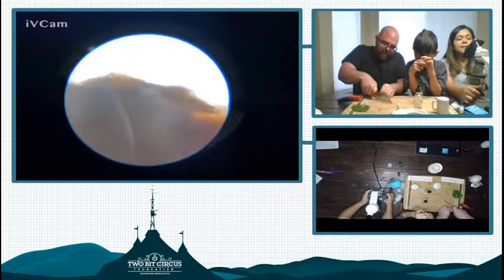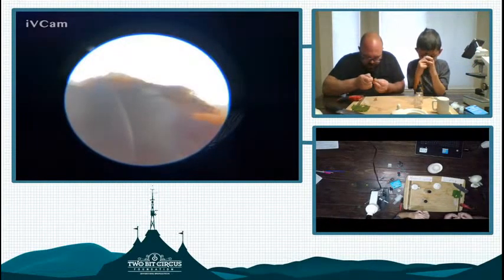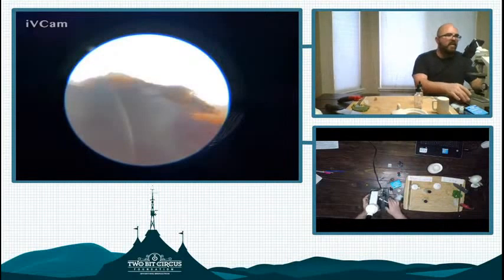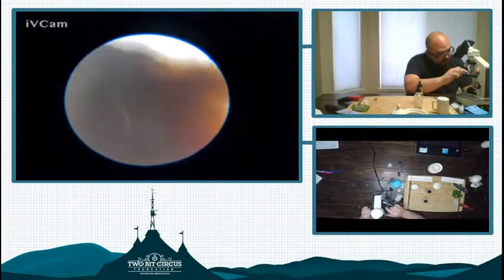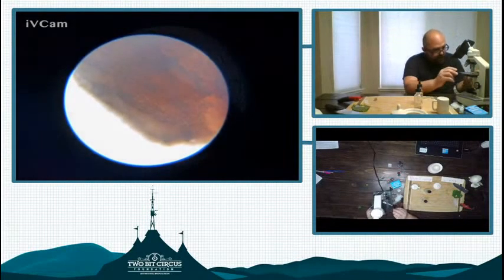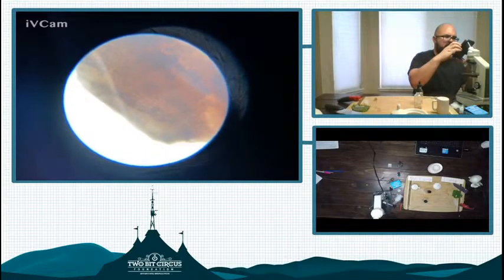Yeah, let's try doing this. Clean cut. Well, kind of. Alright, let's go over, Robert. Let me take a look at that. We're going to try to get a cleaner cut for you. That's what Malin is going to do. So we're switching roles, and I am going to go back to the microscope here and see if I can see anything. And I could see something. I don't know if the glare is too much with the camera.